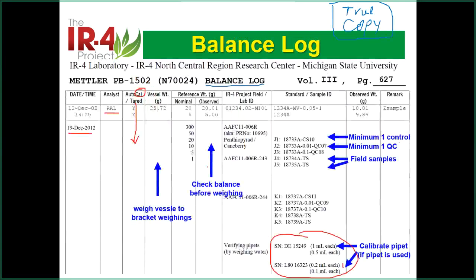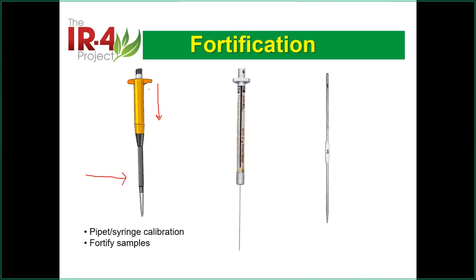I did that. Okay. So this one, and you can use an airtight syringe. In this case, because this is a piston as well, you still have to verify, even though it's small. How you verify is very difficult because the volume is small. So it's difficult. It depends, and that's why most of the spike is this one.